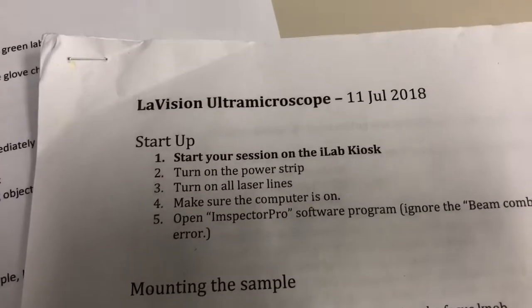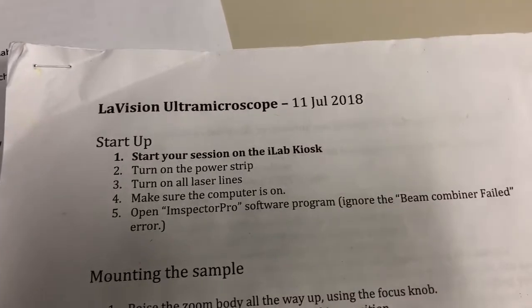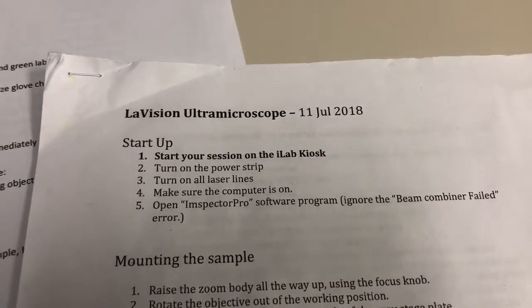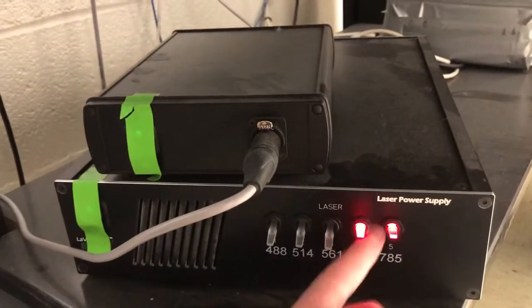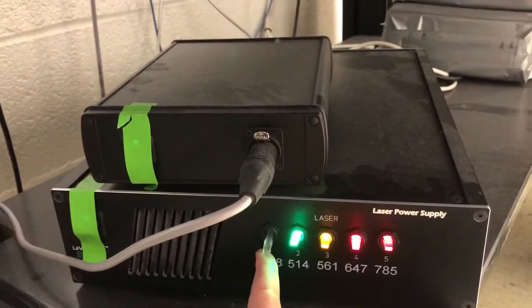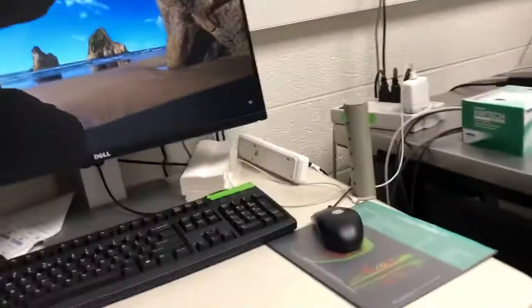The next step is to turn on laser lines — all of them. Even if you're not using all of the lasers, you have to turn them all on, otherwise there's going to be an error message that's very distracting. The laser lines are down here. This is a box where you turn these on one at a time, and they have colors similar to what the color of the laser is.